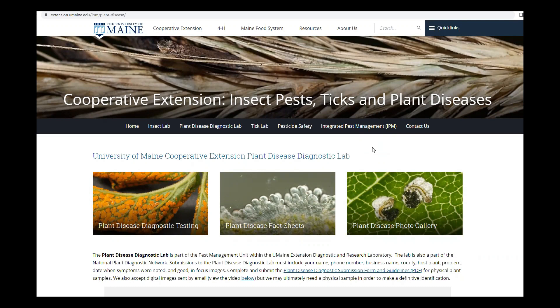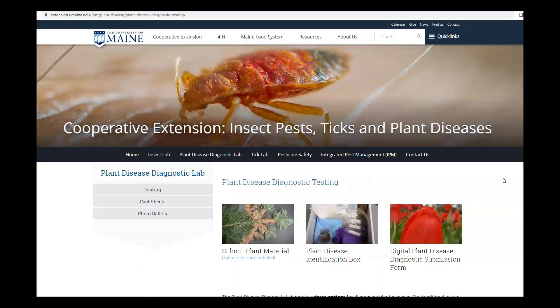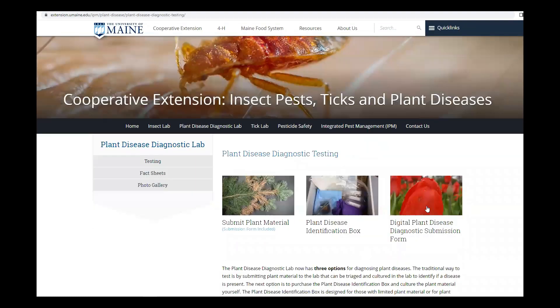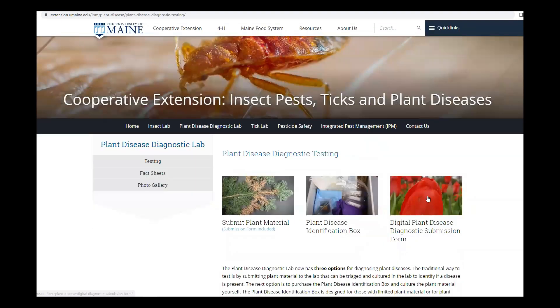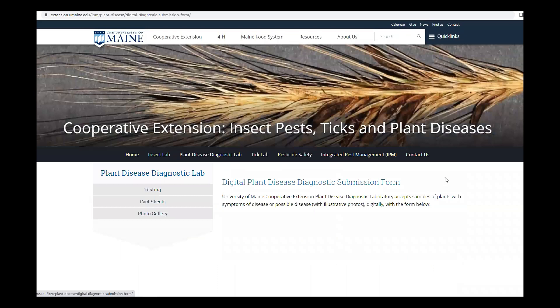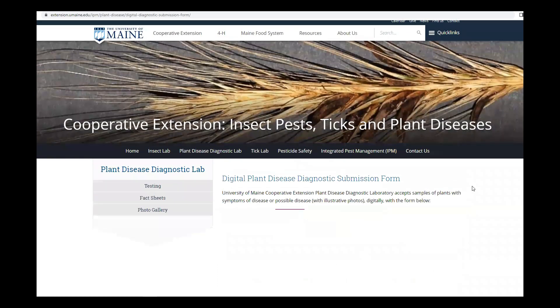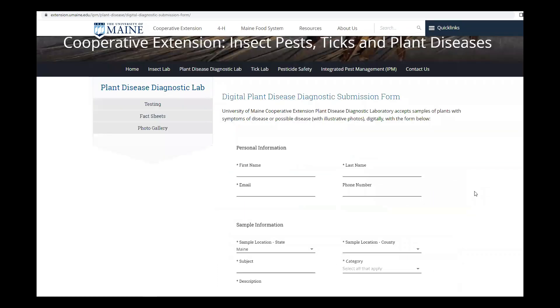This is how you can submit a digital diagnostic form. First, go to our website and select plant disease diagnostic testing. Then select the digital plant disease diagnostic submission form.